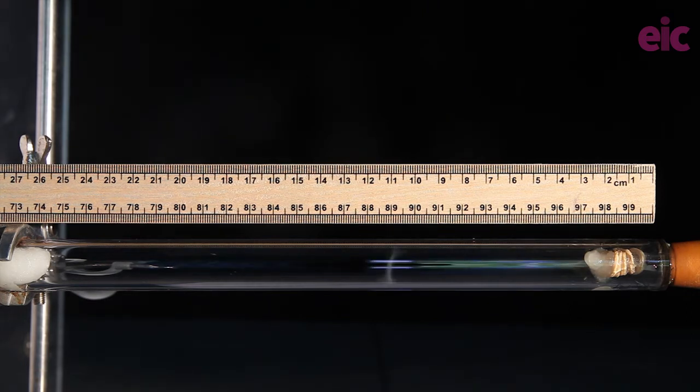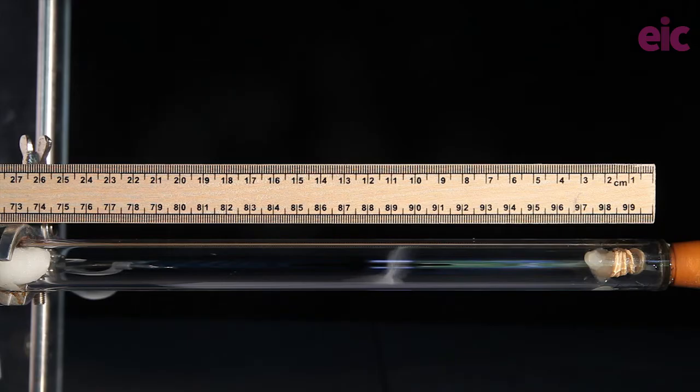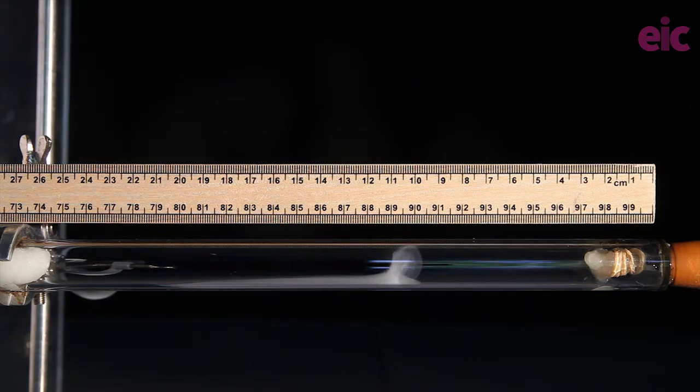After a minute a white circle of ammonium chloride forms closer to the source of the hydrogen chloride than to the source of the ammonia vapours. As Graham's law doesn't apply to this situation I tend to leave things here but it is worth at least mentioning that the particles of hydrogen chloride are heavier than those of the ammonia.